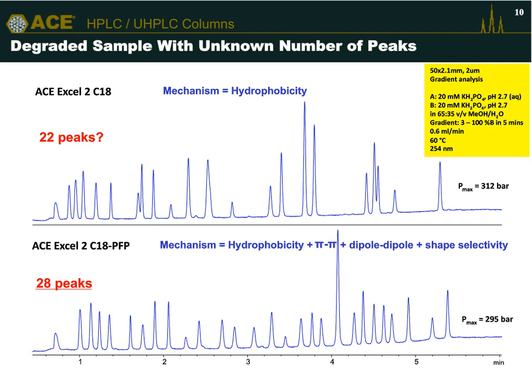Now, in this example, this is a simple example using LC-UV. Most powerfully, you would use LC-UV-MS, so you could use the power of the mass spec to track those peaks as they move around the chromatogram too, giving you that extra information as well.